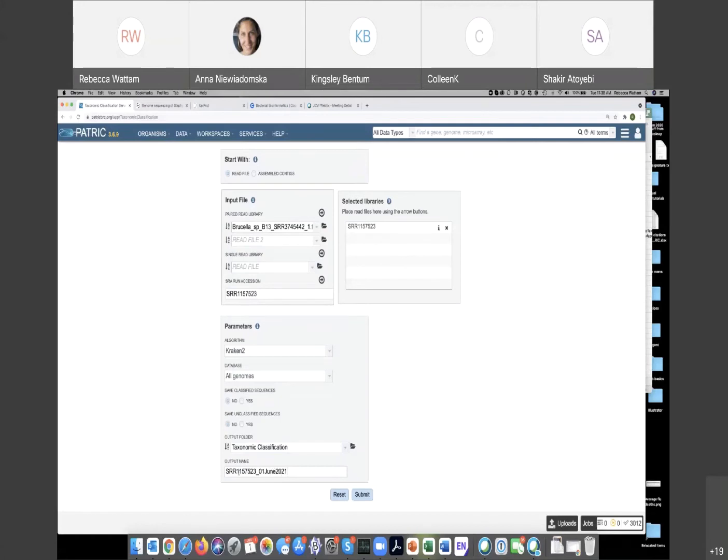For those of you who are international, often you should try to use the standard characters. If you use the ñ for Spanish or whatever it is in Portuguese, the irregular characters will throw this stuff off. So you notice when I named it, it suddenly became blue and I could submit the job. And so I submit it and it says it's submitted.